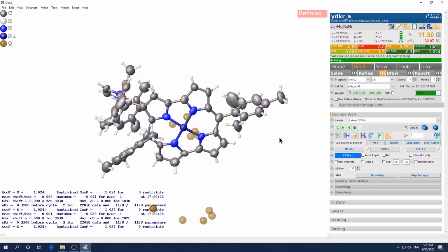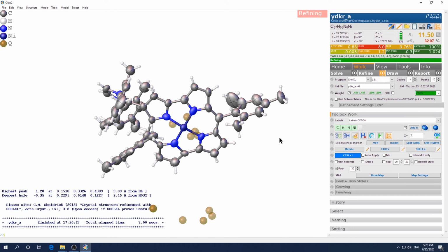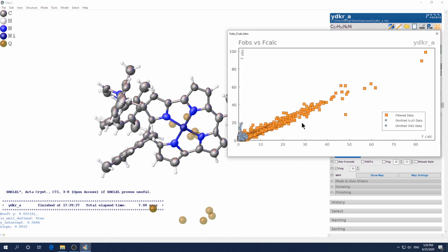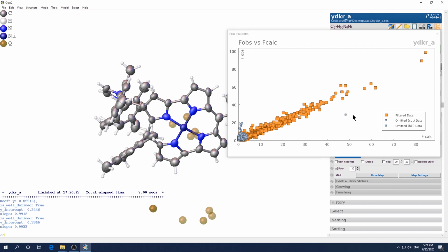And the final thing, you want to check the bad reflections or outliers. Let's check here first. Okay, see, this is weak data we excluded by that shell, 999.83. Basically, you omit all those reflections with I over sigma below 1. And here, this is a huge outlier. It's 112. You just ignore it safely.